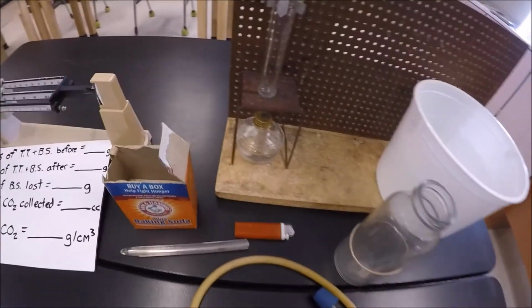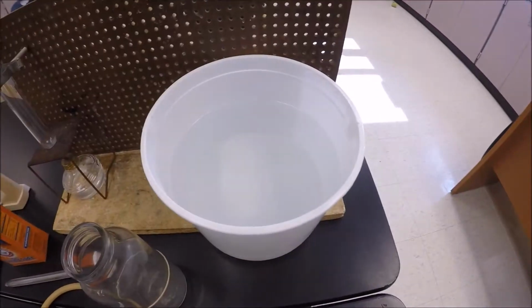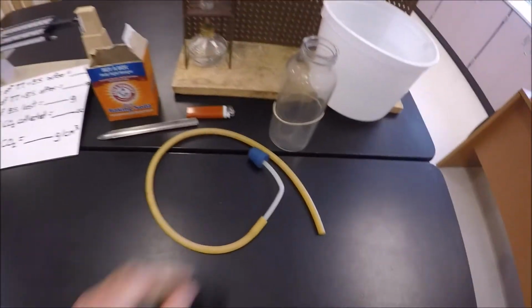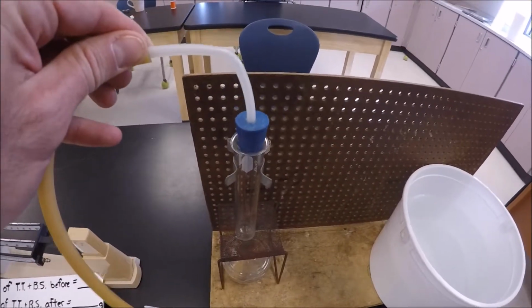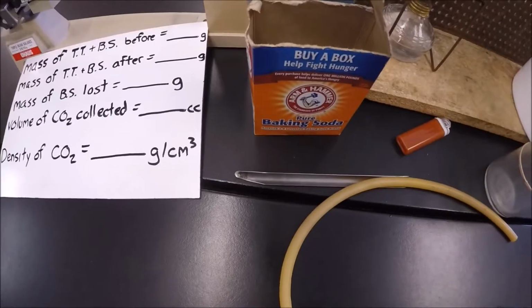Underneath here we have, as you can see, there's an alcohol burner there ready to go. We have a bucket, which is about 2/3 filled with water. We've got a jar and a rubber band. We've got this little device here, which I call a gas retrieval system. You can see this basically plugs into the top of the test tube. And we've got baking soda, spatula.